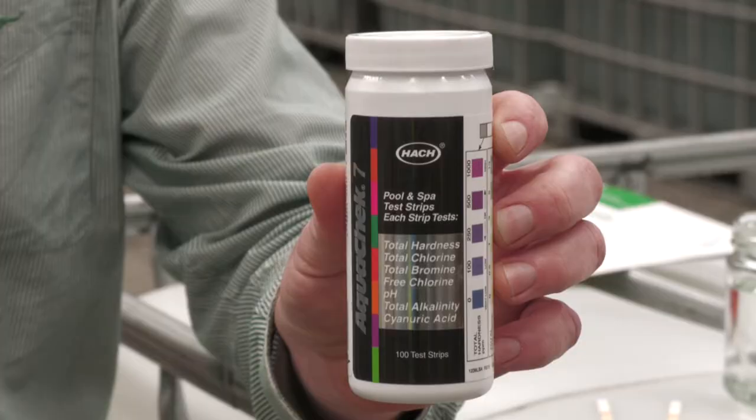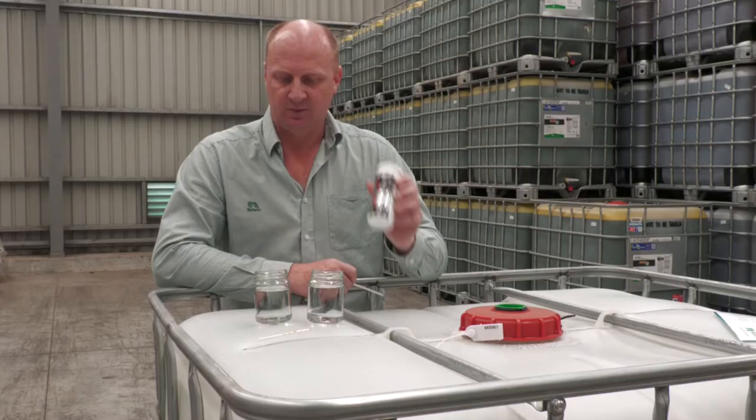The first step when looking at water quality is to measure what we have. A very simple and effective way to do it in the field is to use water test strips — put them in the water, pull them out, and 15 seconds later it gives you a reading.